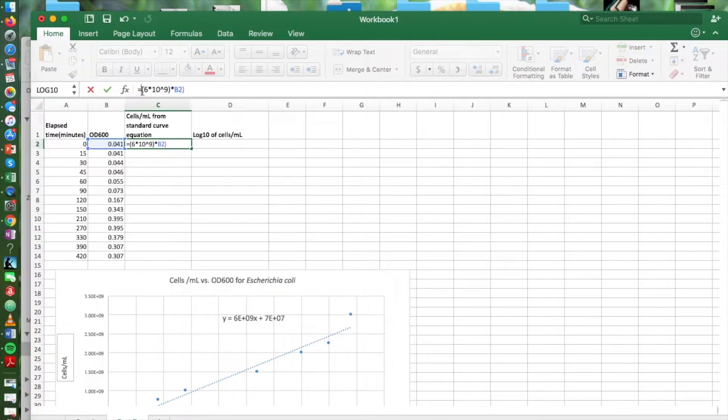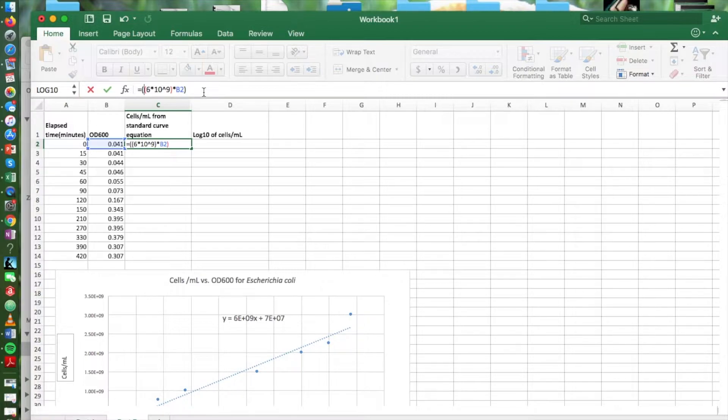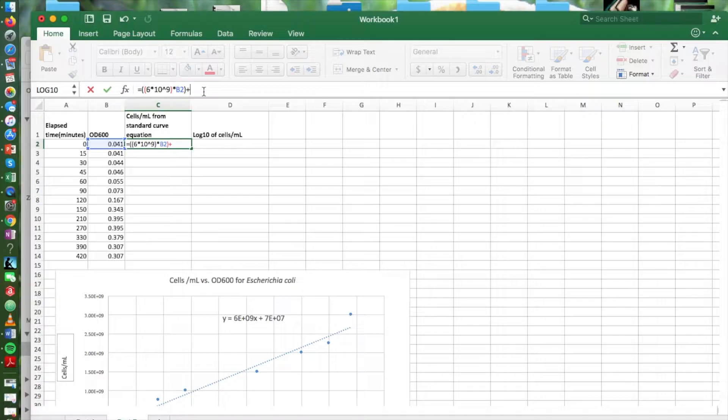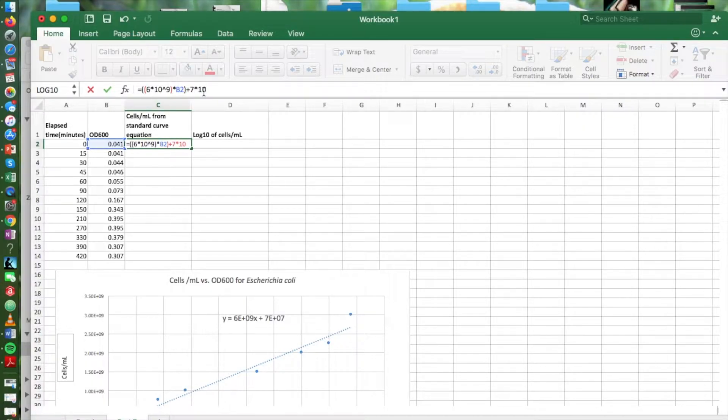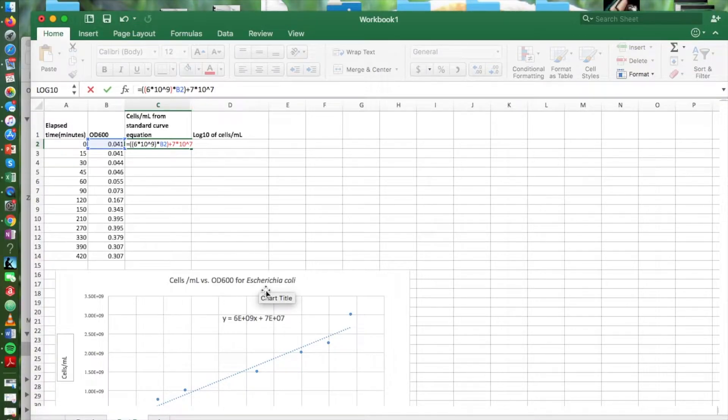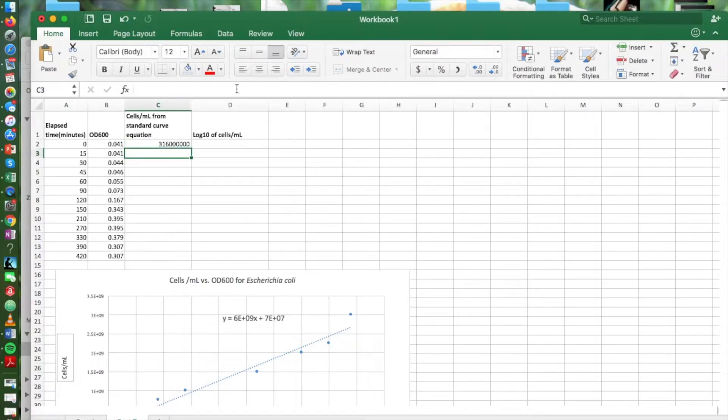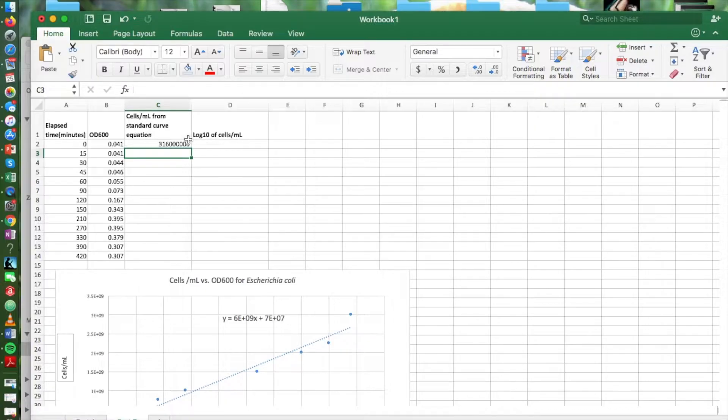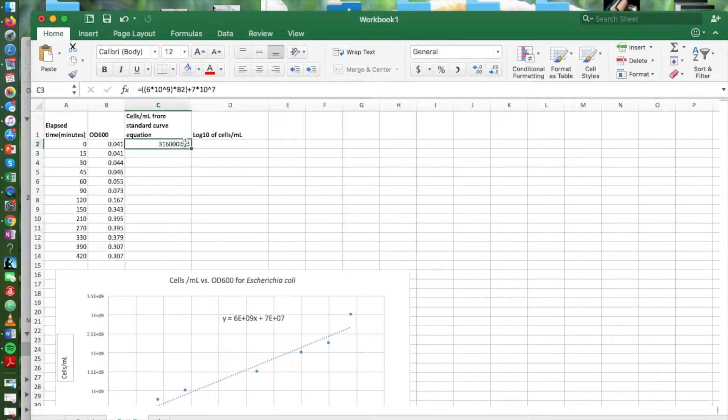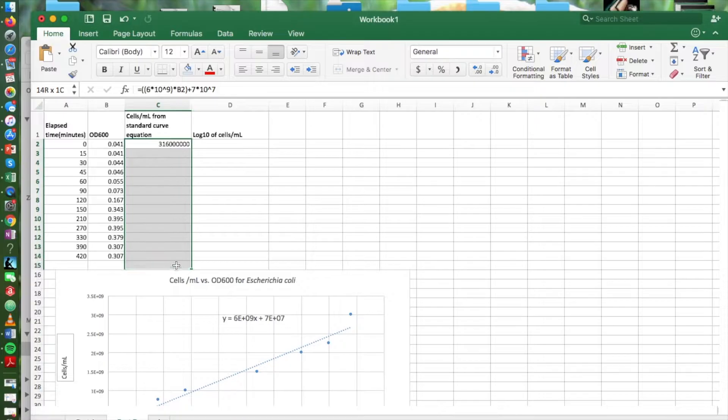That is 6 times 10 to the 9th times our X plus 7 times 10 to the 7th. And we're going to hit enter. And there is the cells per ml that corresponds to our first OD reading.